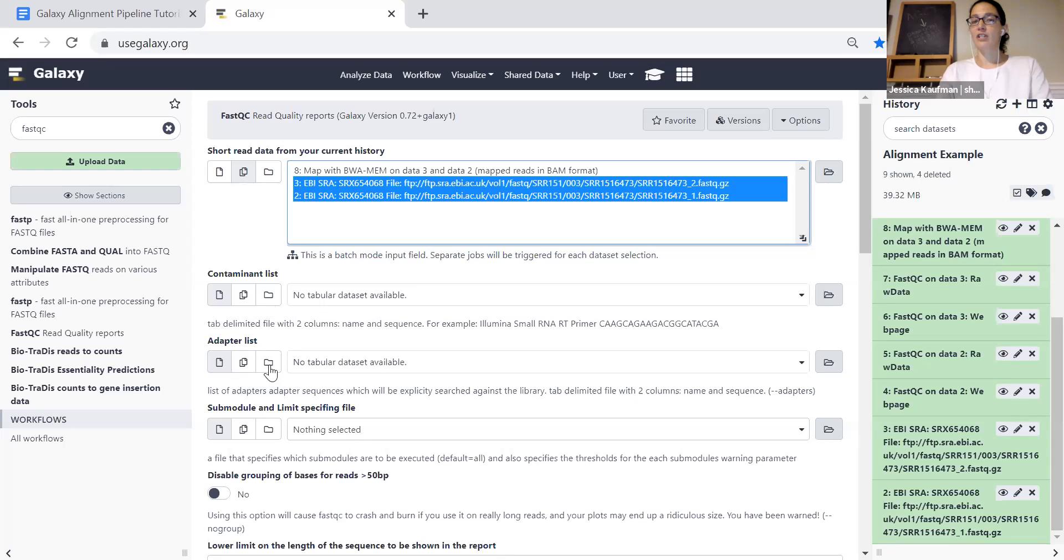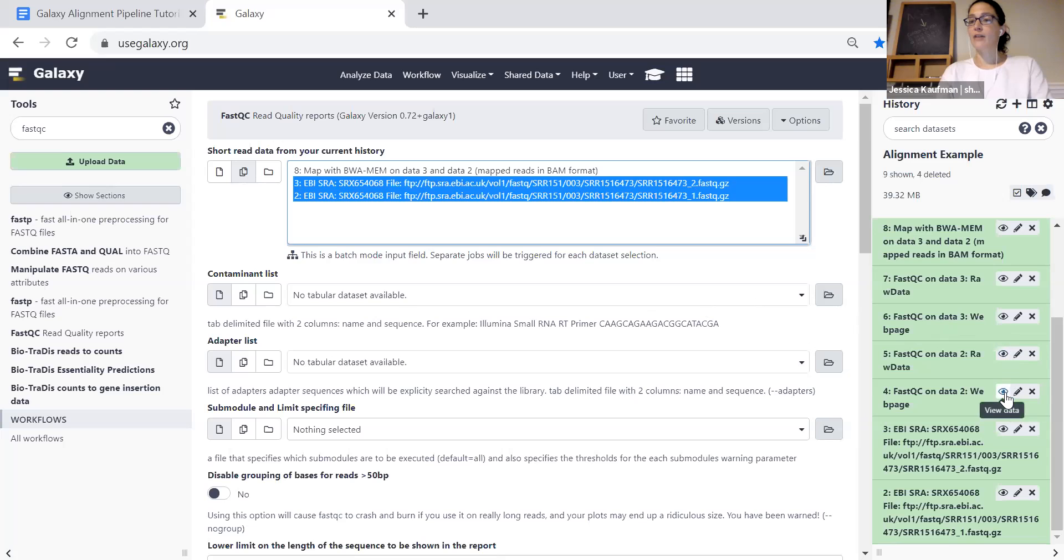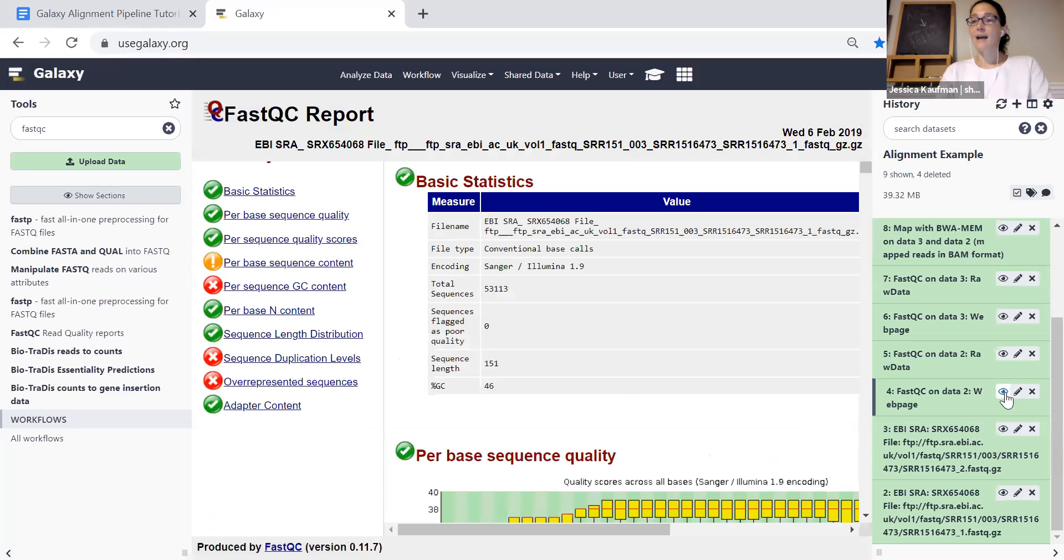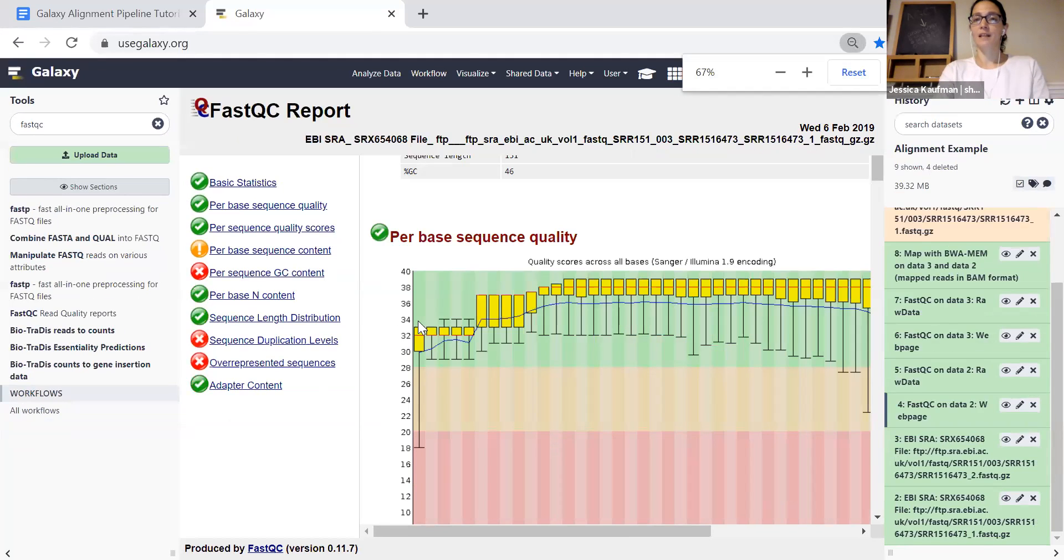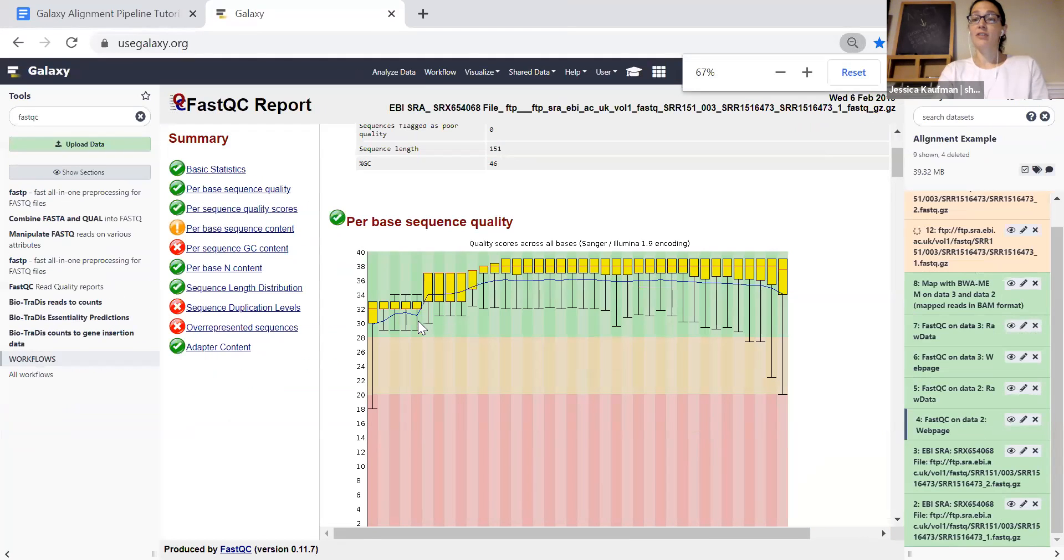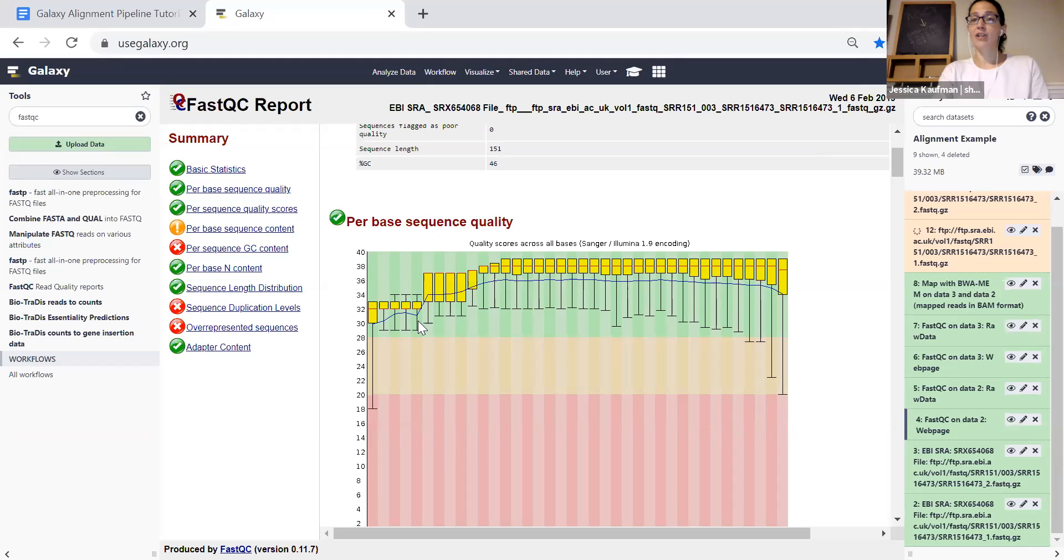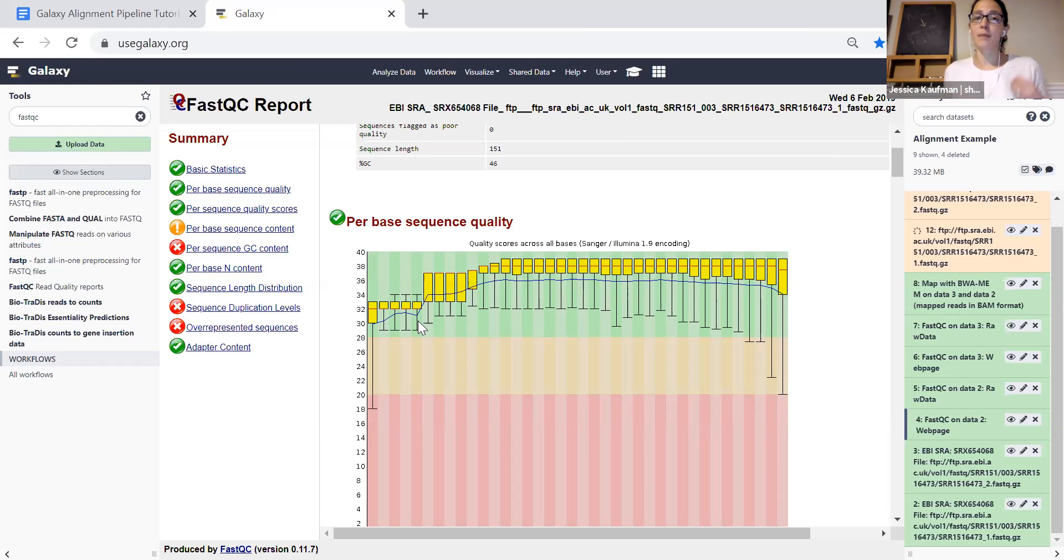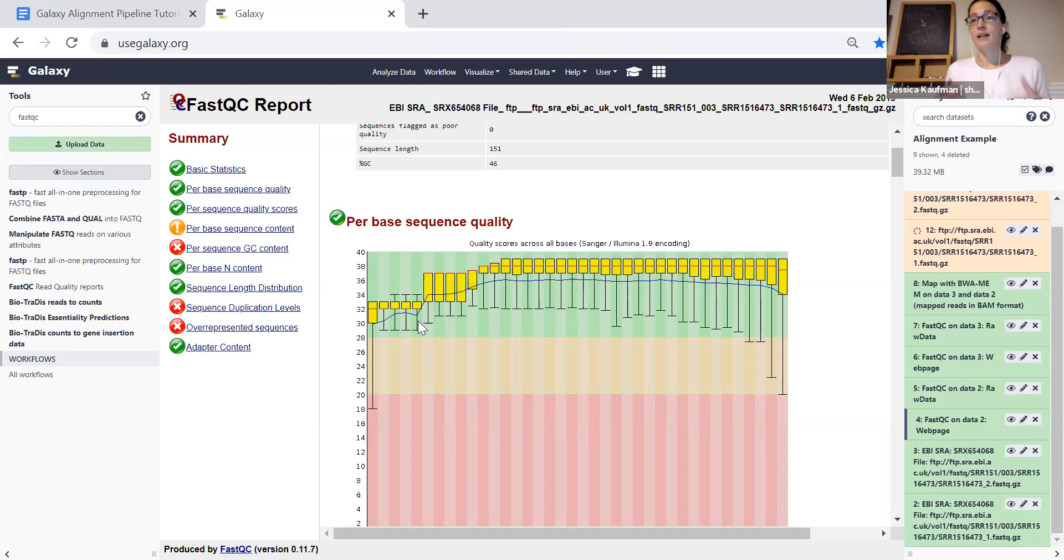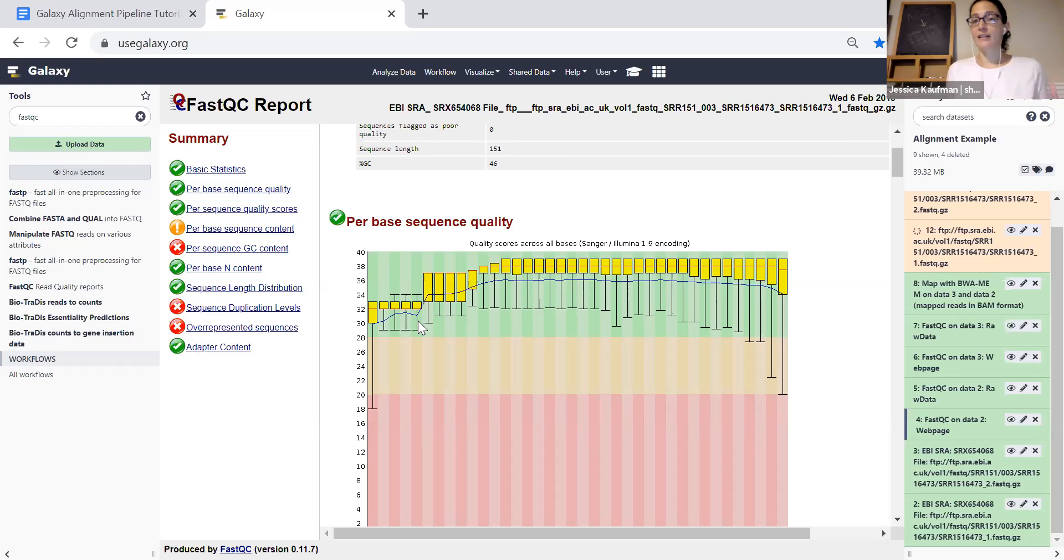I don't need to change any of the settings in the fastqc report and once I run it, it will turn gray and then yellow and green and I can click on the eyeball icon to look and see how high quality is my data. I'm using the control minus function in my browser to be able to zoom and change the zoom so I can see the whole graph. And I can see that there's a green check mark next to per base quality score because this data has already been filtered. It's already been trimmed and so we only have high quality bases in our reads. We're ready to do the alignment.